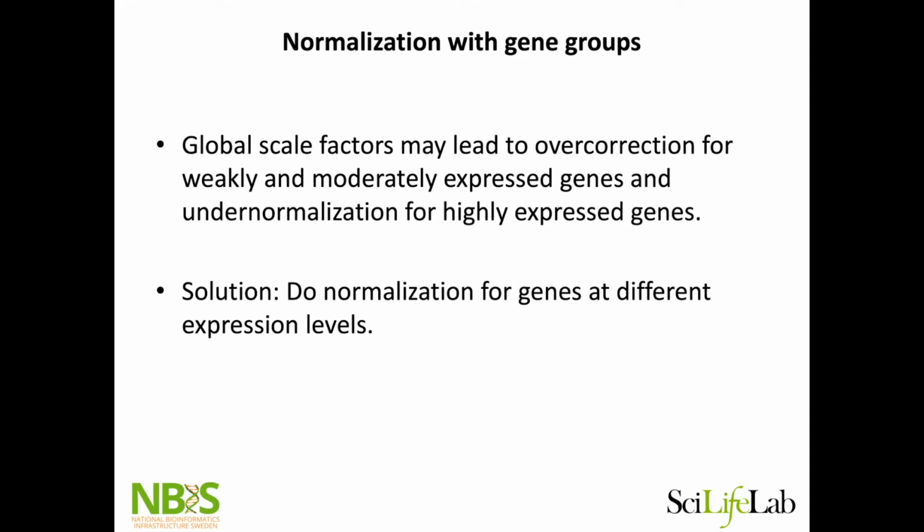It's also a case where even though it's a gene you're interested in, you can remove it from the normalization for doing clustering and everything. And then you can bring it back again and do differential expression with it and without it, compare the results and see. So it clearly depends on what your question is and what those genes are.